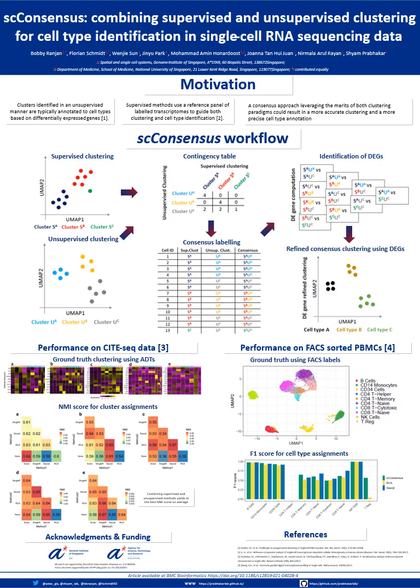and supervised methods. Unsupervised methods are really great to find novel cell types and cell states, and cell types are usually annotated using differentially expressed genes between clusters, literature markers, and canonical marker genes. Using supervised methods, we have a very strong robustness against batch effects, but we do have to have a reference and might be a little bit limited by that particular reference.